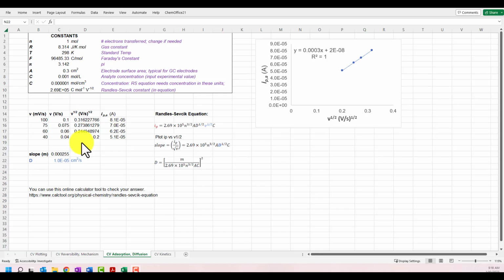In order for us to evaluate what the diffusion coefficient is, which is D here, that's ultimately what we want to compute, we first have to evaluate whether or not this relationship, which we call the Randles-Sevcik equation, is usable. To do that, we have to evaluate that first question, which I mentioned. Is the molecule adsorbed to the surface when it transfers the electron, or is it freely diffusing? That's a really important clarification, because if the molecule is adsorbed, then we cannot evaluate D using this equation. In fact, we just won't evaluate the diffusion coefficient.